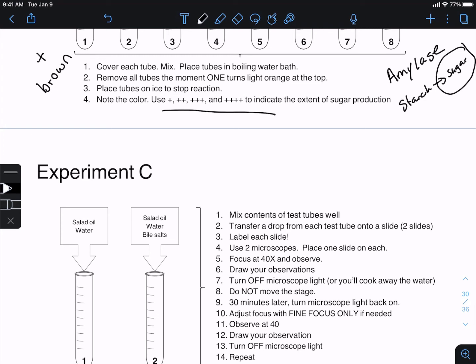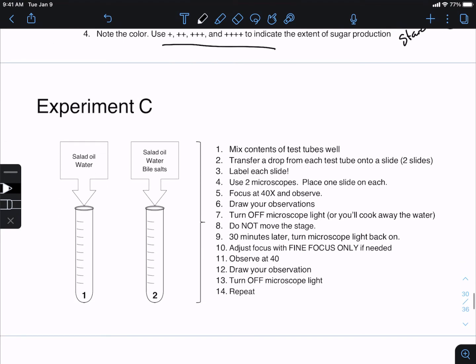You're going to use dish soap to clean those test tubes, but if it still is orange, then there's a paste in the back. This should be by each of the sinks. You can put some of that paste onto a bottle brush. Those should also be back by the sink, and use it to scrub out your test tube. Do the best you can with it. Remember, I'm going to be checking to make sure everybody's doing a good job cleaning up the lab.